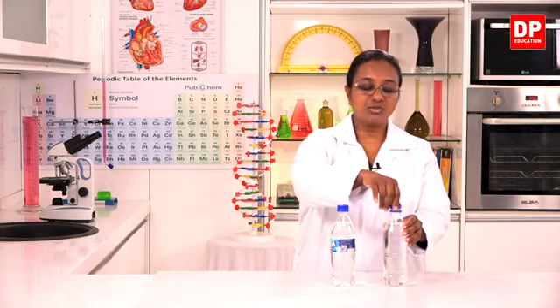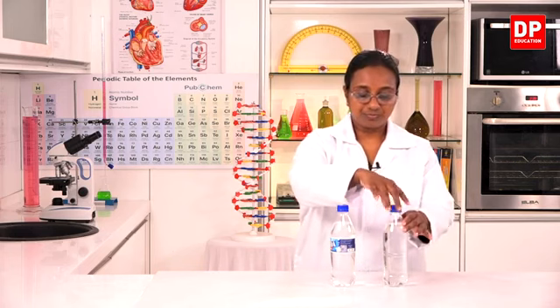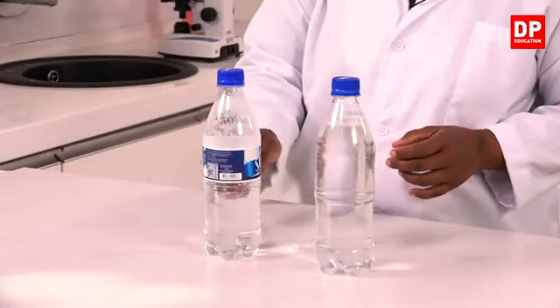Here you can see if I open this also, there is no evolving of gas. It's the same liquid water. Now I will open this bottle. You all are already familiar with homogeneous and heterogeneous mixtures. This is a homogeneous mixture at the moment because you can't differentiate between the water and the carbon dioxide dissolved in it. Now I will open this bottle a little bit. Now you can see the gas bubbles coming up.